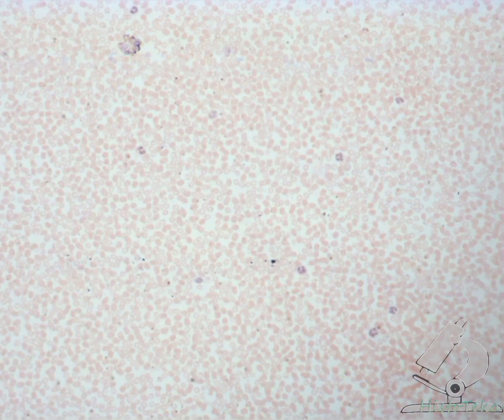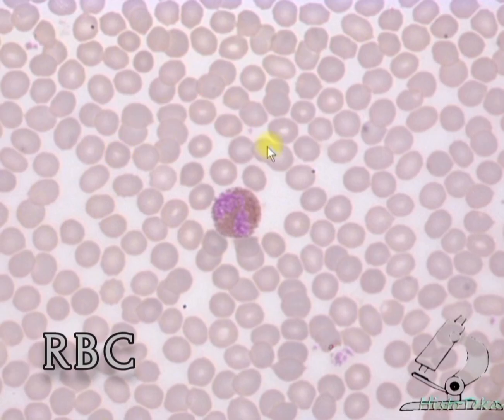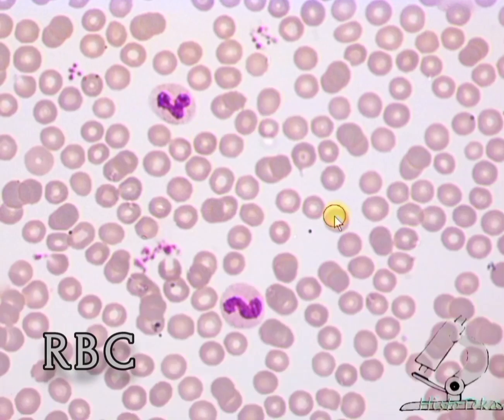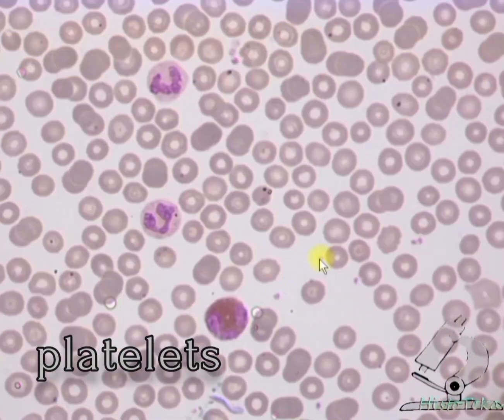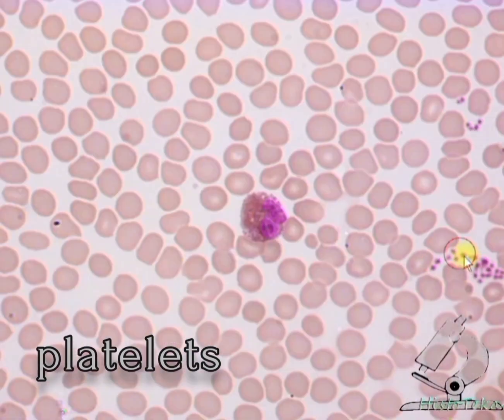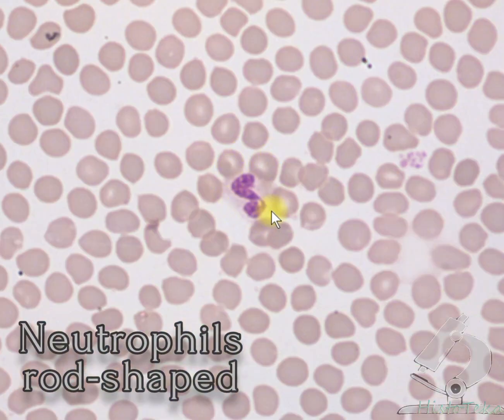So, briefly about the blood smear preparation. Erythrocytes or red blood cells. Platelets or thrombocytes. Neutrophils rod-shaped.